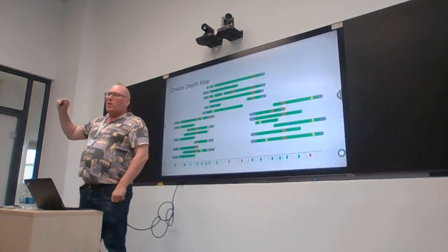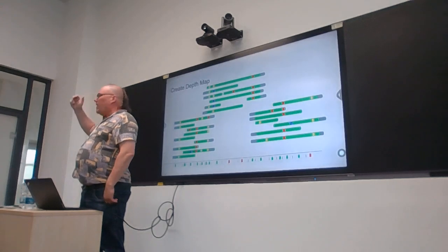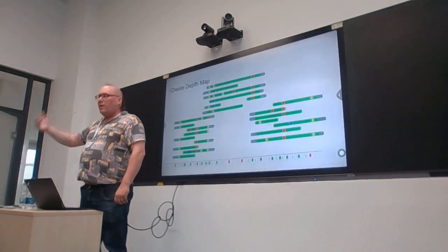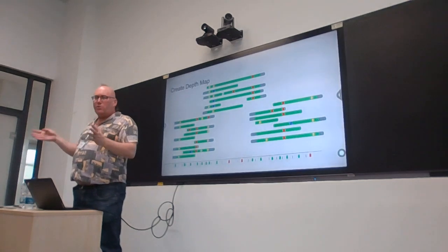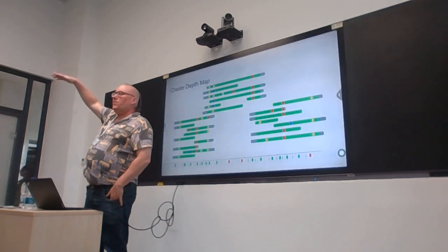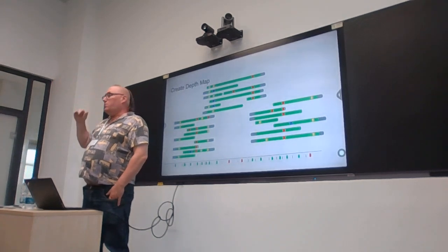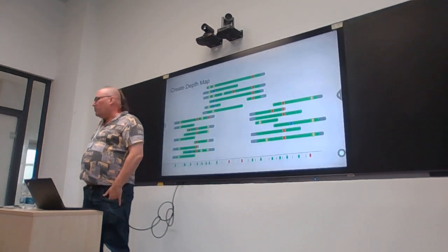Normally, I set my minimum allele frequency high because I want to know the fixed positions, which are going to really help me with my genomic epidemiology. Yes, within-host dynamics are interesting, but I normally say I want at least 70%, 75% of the reads supporting something, for my work. I don't know if other people have other approaches.